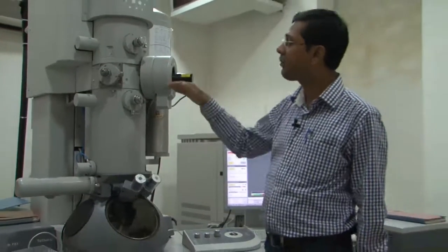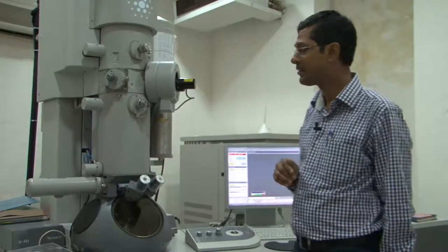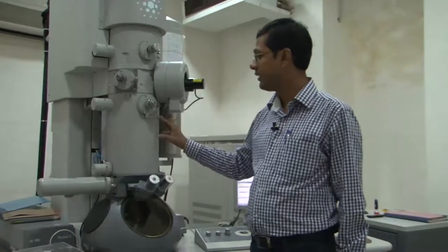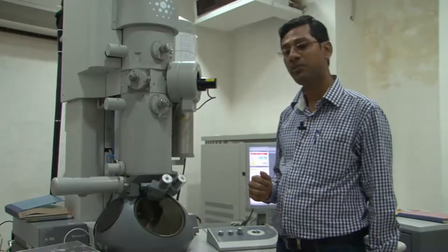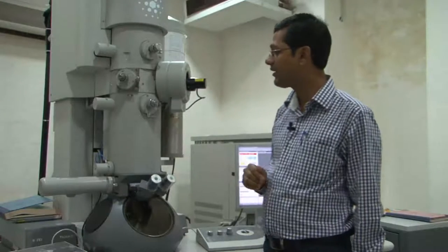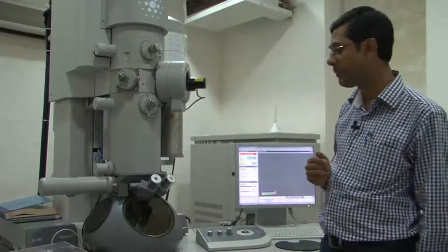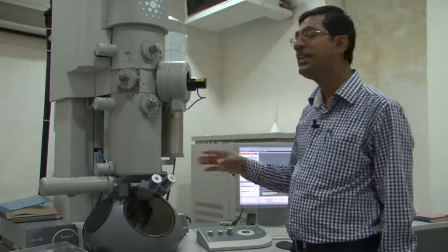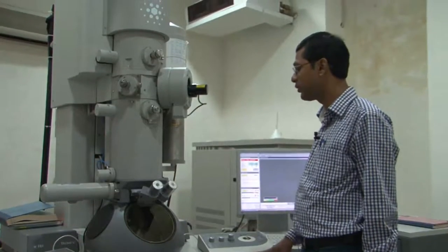Remember, in an electron microscope, the diffraction pattern forms on the back focal plane of the objective lens. So depending on your wish whether to use the diffraction pattern or the image, you can energize the intermediate lens more or less, to get either the diffraction pattern on the screen or the image. And that is normally routinely done by the microscope system. We don't need to bother, we just sit at the microscope and do it.